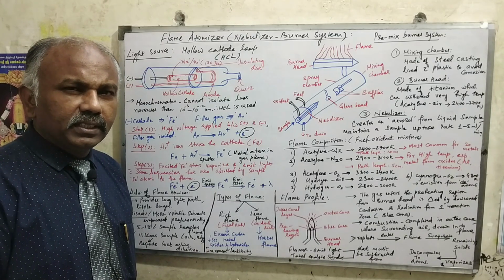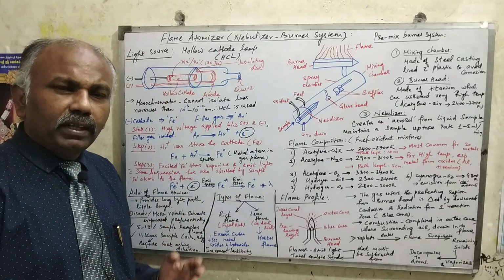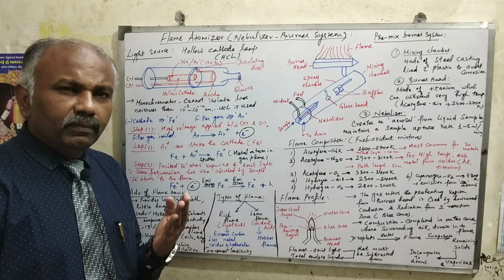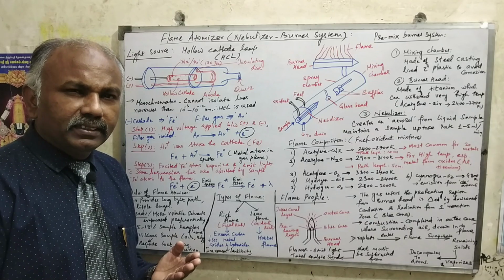Today we are going to discuss the topic of the flame atomizer. What is this flame atomizer? The flame atomizer is a very important component of the atomic absorption spectrometer. The flame atomizer is also called the nebulizer burner system or premix burner system.